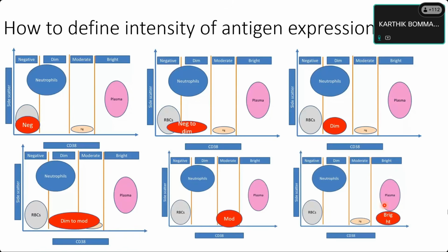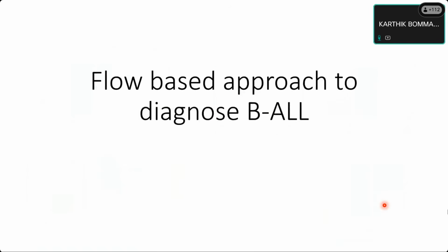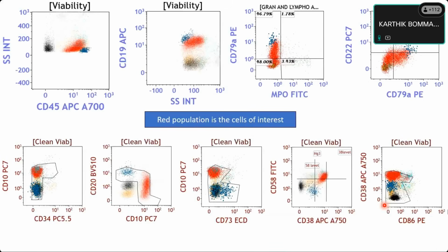Okay. So with this in mind, Dr. Swati will now interpret these flow plots. Dr. Swati, the red population is the cells of interest. So what is CD45 expression?